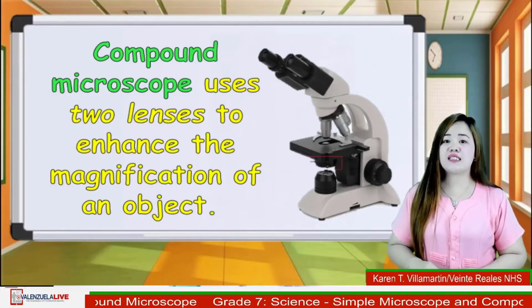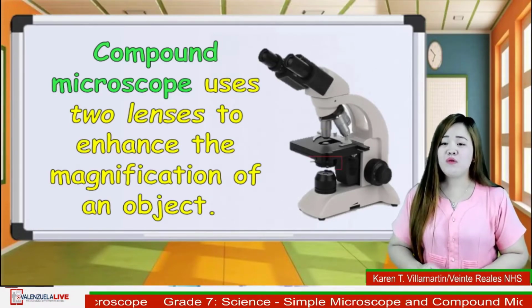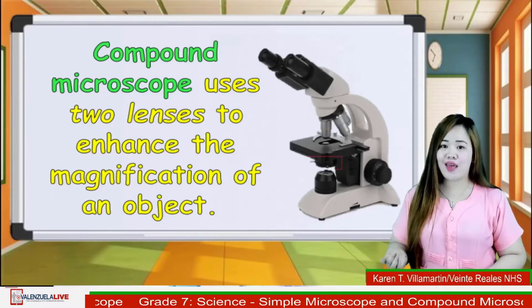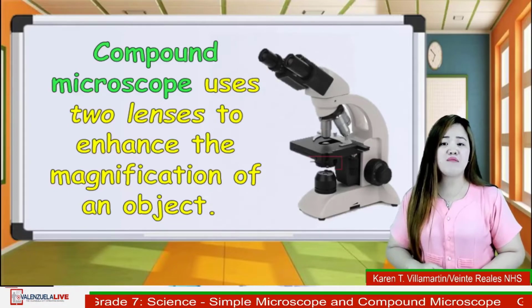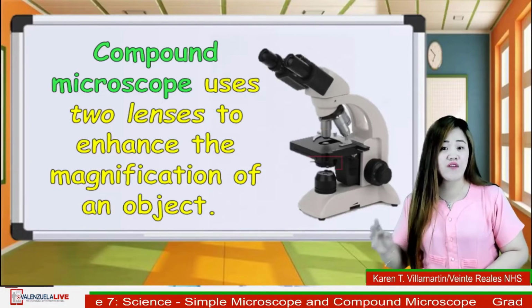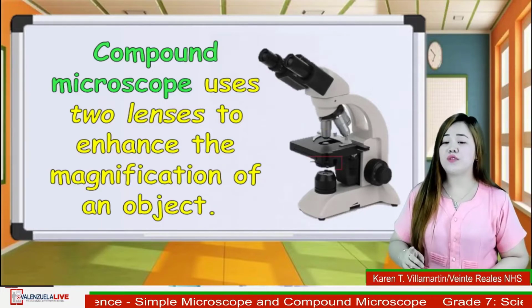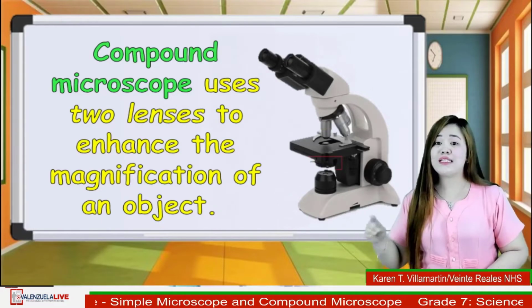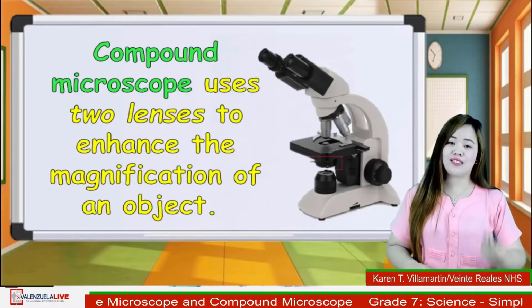These devices provide a magnification of 1,000 times, which is considered to be high, although the resolution is low. This high magnification, however, allows users to take a close look at objects too small to be seen with the naked eye, including individual cells.